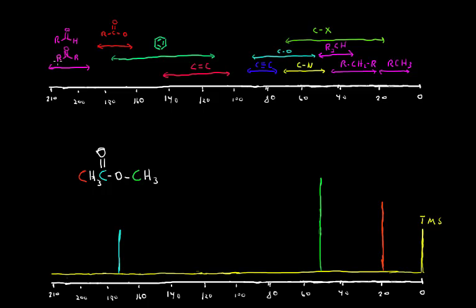If there's a double bond or a benzene ring that the pi electrons in the carbonyl are in resonance with, that moves the resonance a little bit upfield, generally from about 190 to 200. So that gives you an idea. So again, the chemical shift that we see for carbon atoms gives us structural information, tells us the sorts of functional groups that the carbon is interacting with or is close to.